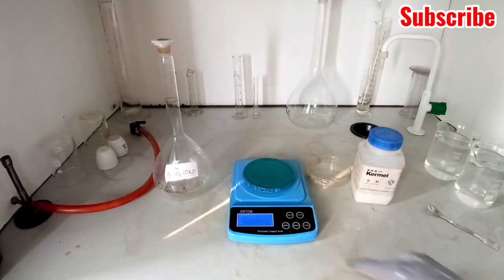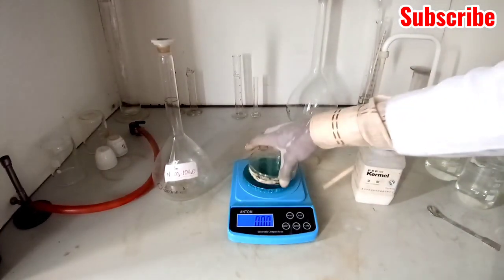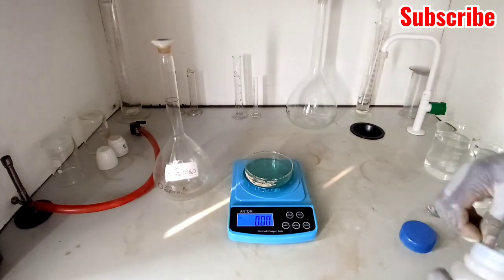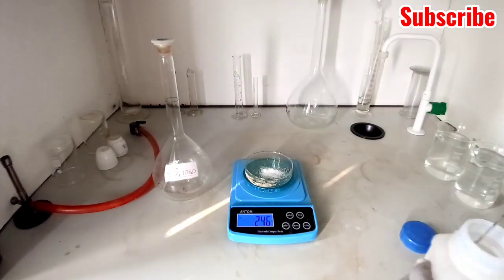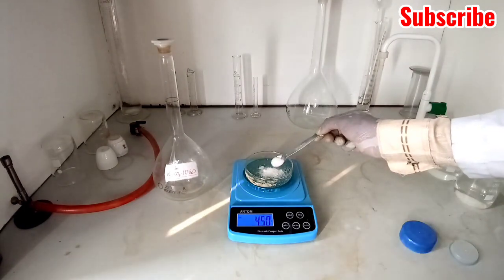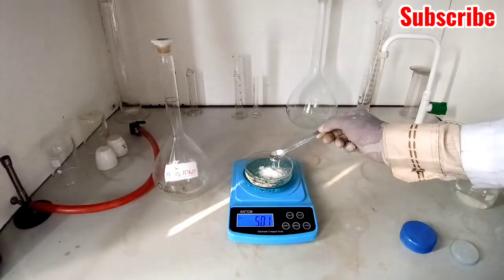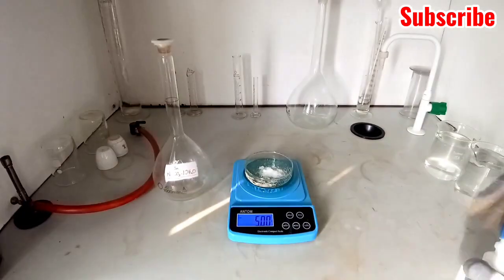Alright, we shall go further to prepare our Bn. There is a weighing balance, a digital weighing balance. We add 5 grams of sodium carbonate decahydrate. You need to adjust it. Alright, this is 5.0, as you can see.